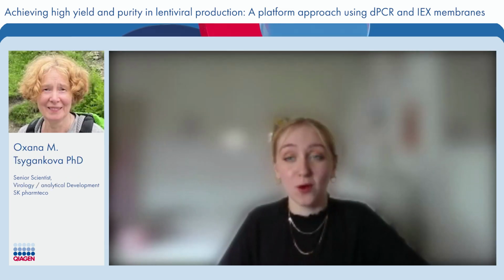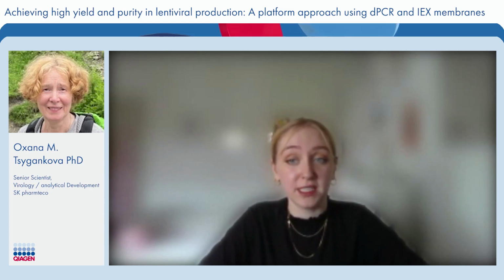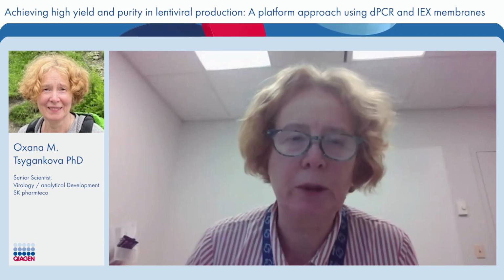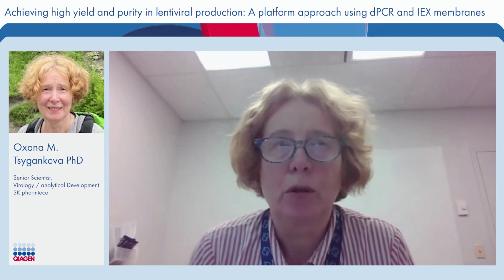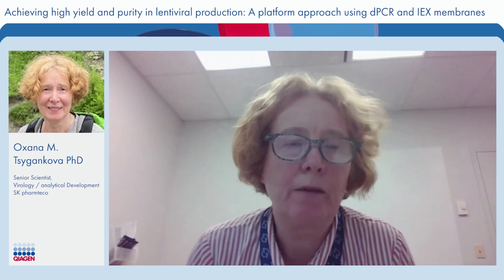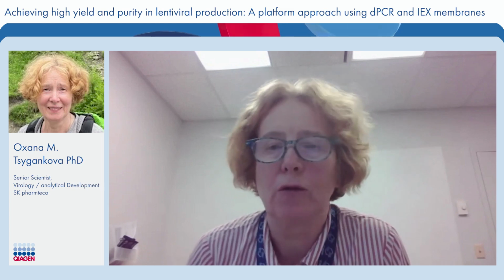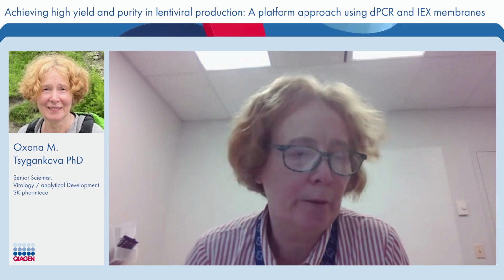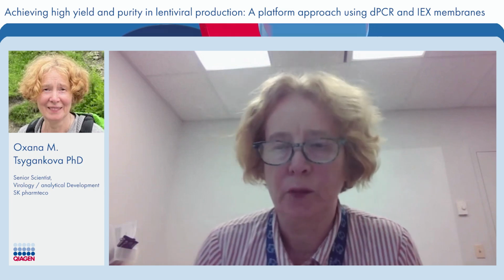And our next one now is for Oksana. What challenges were encountered during the development and validation of the dPCR assay for LV genomic RNA and VSV-G, and how were these addressed? The assay was developed in our analytical development department, and the conditions for this assay were defined so as to get the maximum recovery for RNA and DNA. So the researchers had to determine the concentration for detergent and the time conditions, and they also worked on the conditions for DNase and proteinase K treatments.